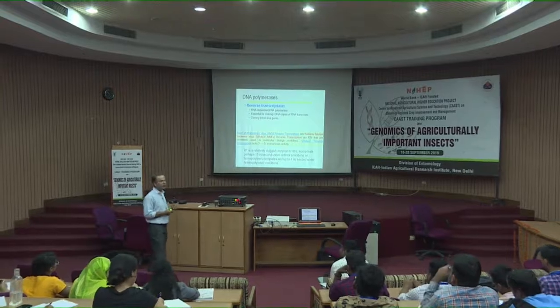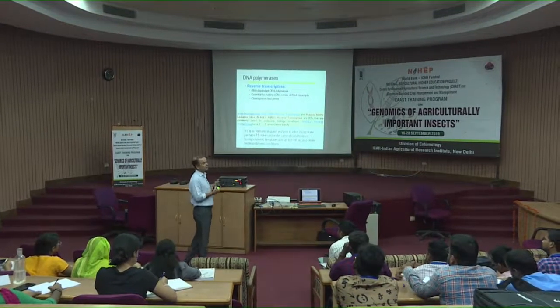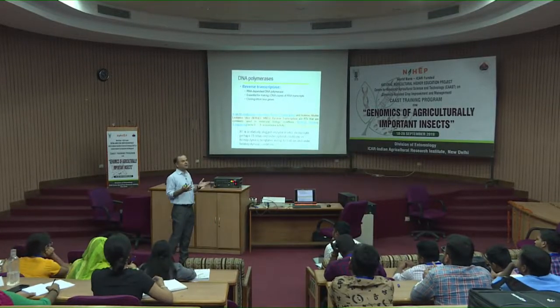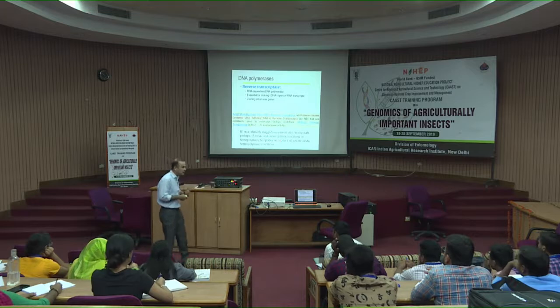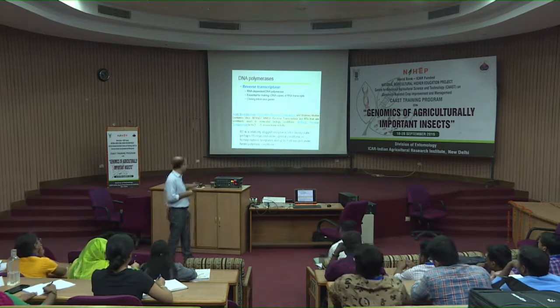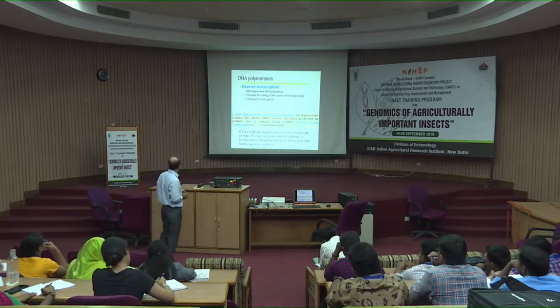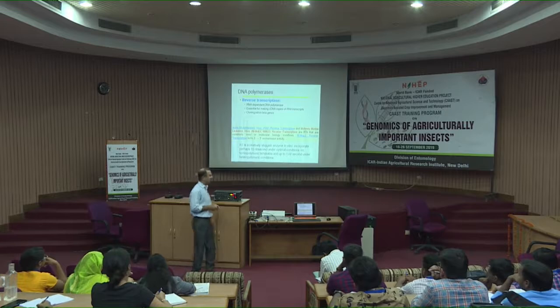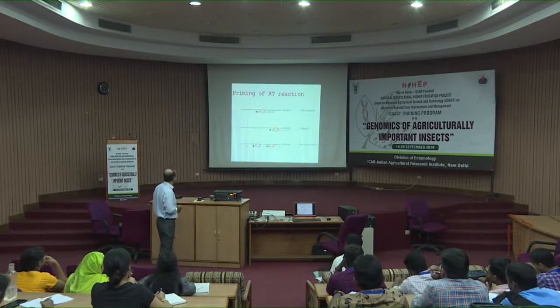So, many a times one of the ways of troubleshooting your experiment, suppose your experiment is failing and you are finding that the reverse transcription process is failing, remember this point that sometimes we increase the time of reverse transcription and we start getting good result, right. So, this enzyme is very slow, and another drawback with this enzyme is that many a times it tends to incorporate errors, but those are different aspects. I will not go into much details of that.